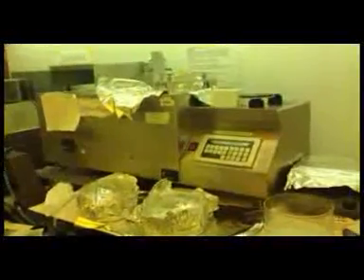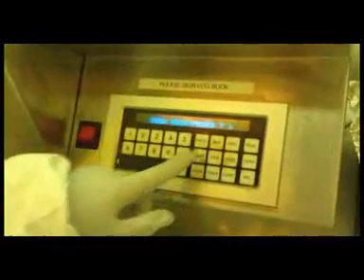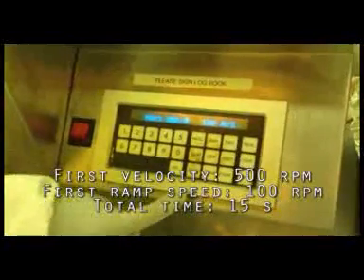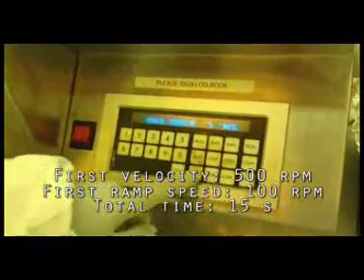If you use the spinner across from the aligner, you need to turn on its own vacuum as well. Now you can turn on this spinner and program your spin cycle. So first you press program, then you enter what program number you're going to call this. Confirm that dispense is off by pressing enter. These are the parameters for spinning a 35 micron layer with SU82035.